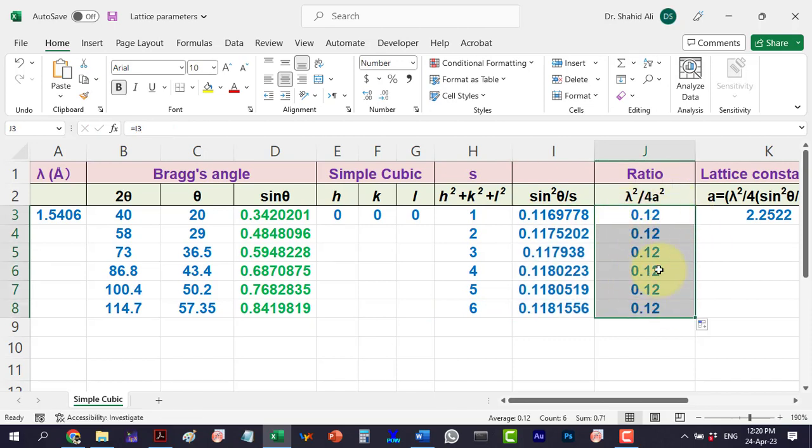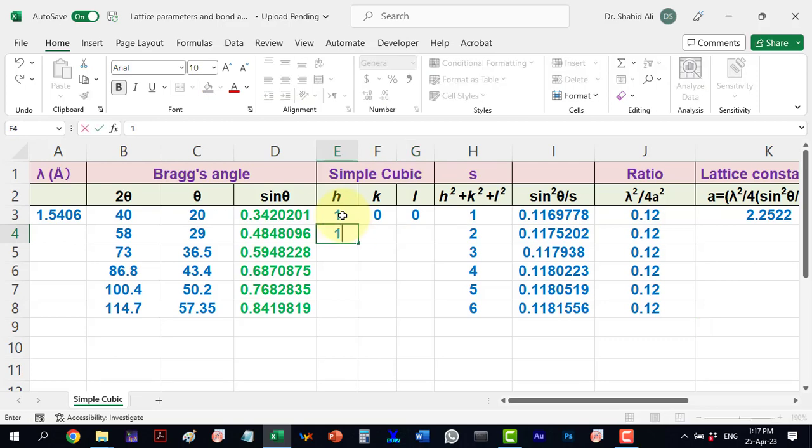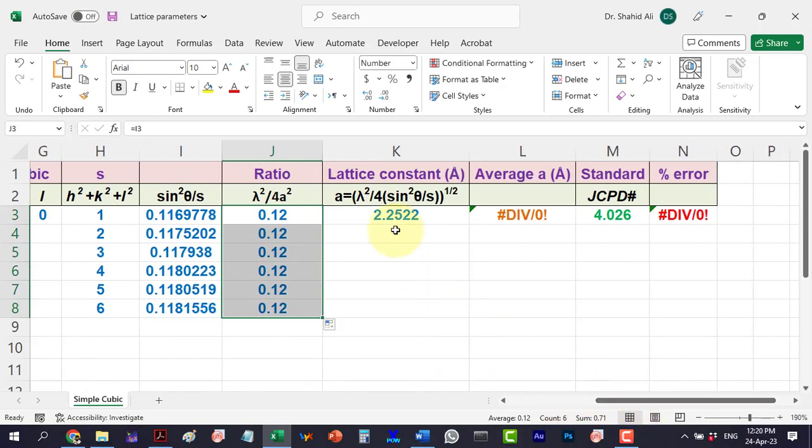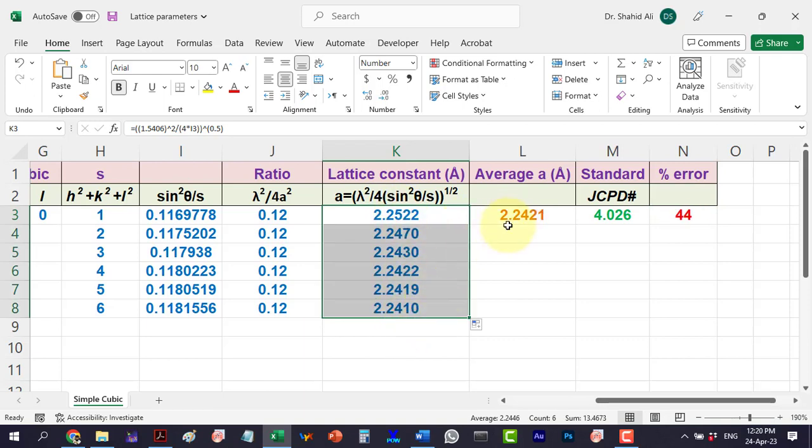This column clearly shows that it is a simple cubic structure. We can now determine the Miller indices. Here the lattice constant comes out to be 2.2421 angstrom. As we don't know the actual value, the afterward columns are irrelevant.